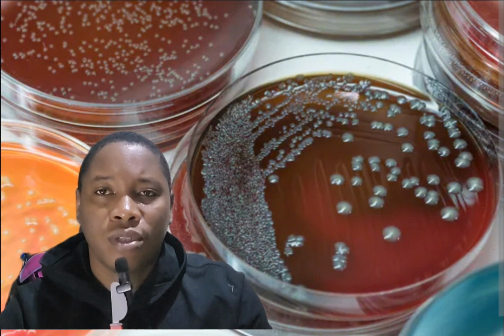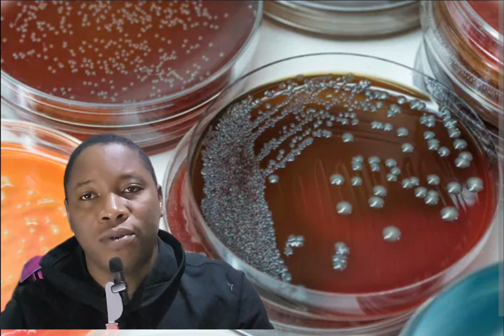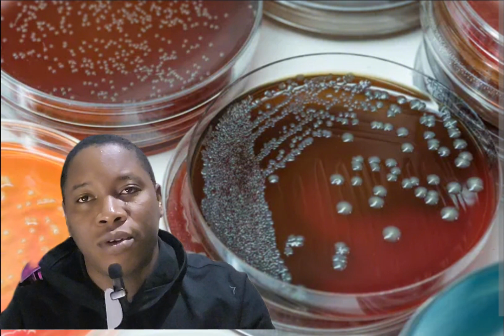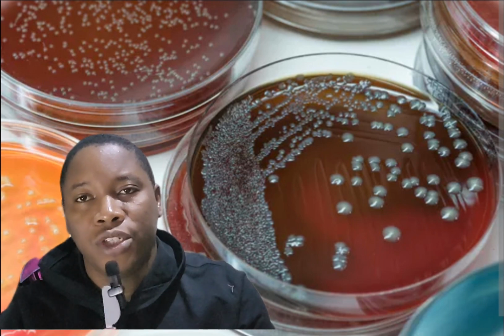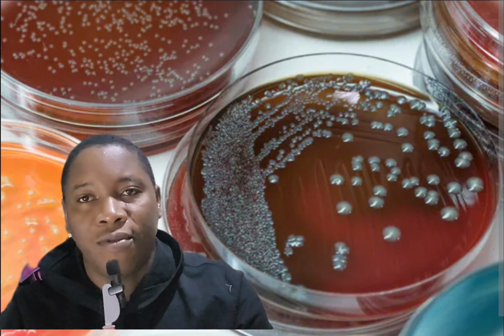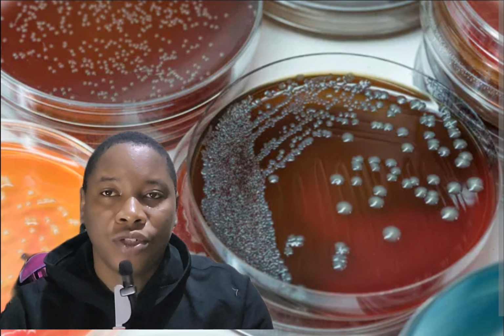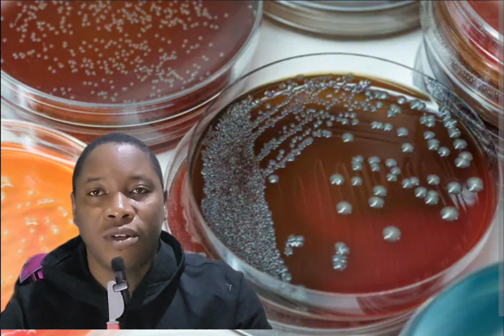But it's important to note that culture-based techniques refers to a group of methods in which in the laboratory we're able to grow microorganisms, bacteria, viruses, and some parasites. We're able to grow them under controlled conditions. So we simulate conditions that encourage the growth of these organisms. And to make this possible, we have what we refer to as culture media. So these are chemical preparations that are used to improve and encourage the growth of different kinds of organisms.